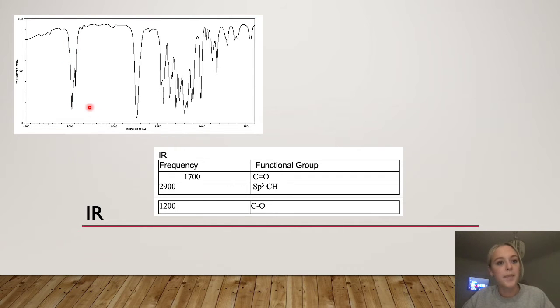because there are no sp2 carbons anywhere in the spectrum. And then finally around 1200 here, you can see the peaks from the carbon-oxygen bond, and that's telling me that this is going to be an ester as opposed to a carboxylic acid, which was kind of what I had narrowed it down to just from looking at the formula.